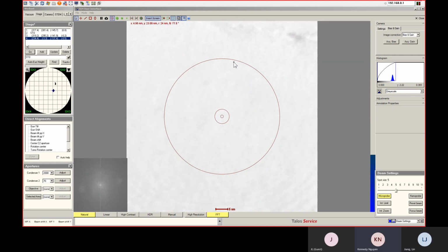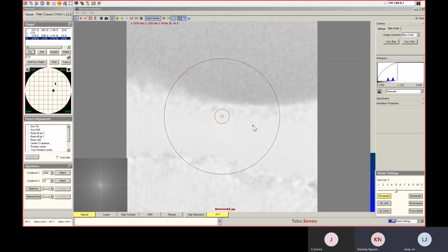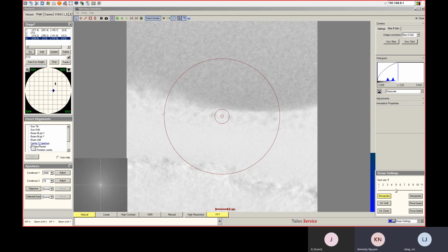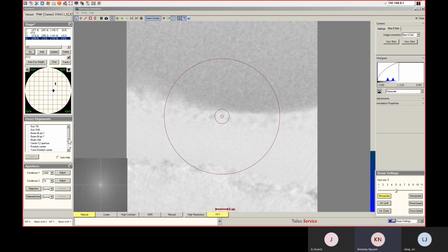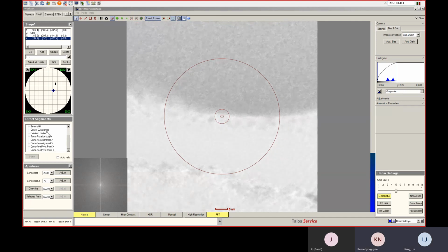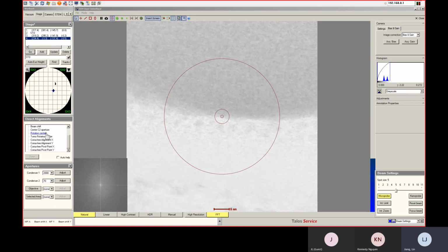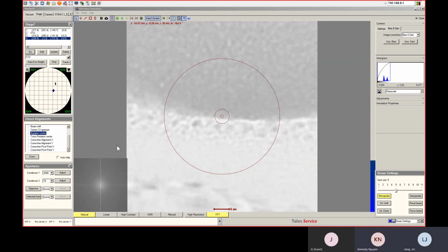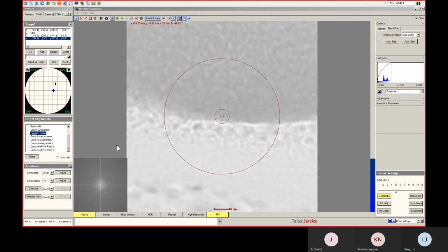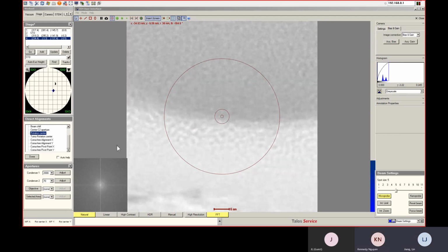We'll do the rotation center here. Okay. Up a little bit. Yeah, we'll do the rotation center here. Evenly spread the beam out. And then this is the highest magnification, right? We're close. Yeah, this is the highest. Okay. I'll do the rotation center. Looks good.